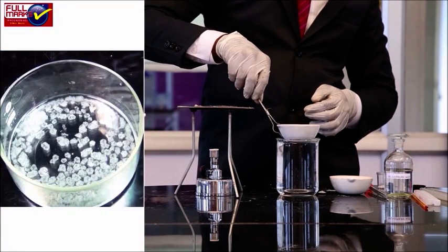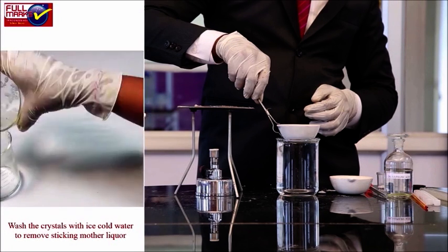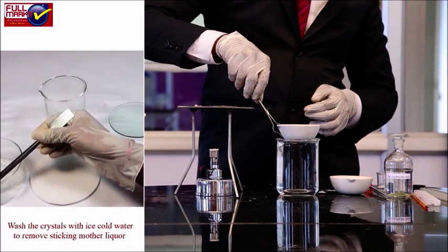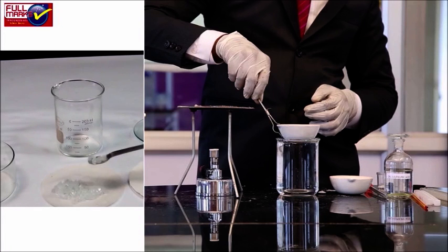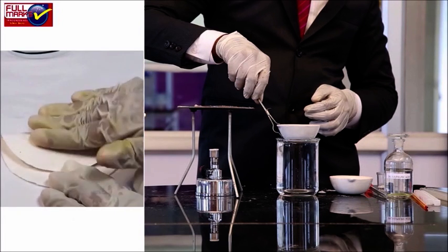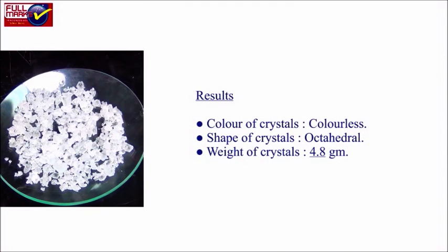Separation and drying of crystals: Decant the mother liquor. Wash the crystals with ice cold water to remove sticking mother liquor. Dry the crystals by pressing them gently between filter papers. Observe the colour and shape of the crystals and weigh them.